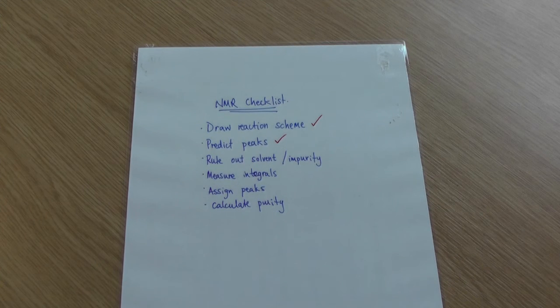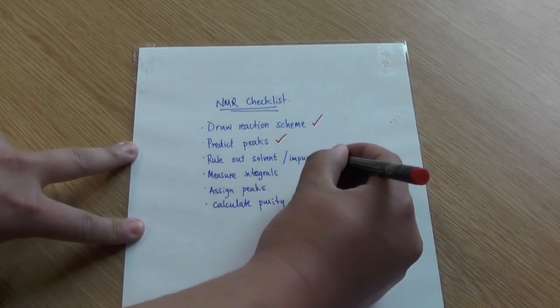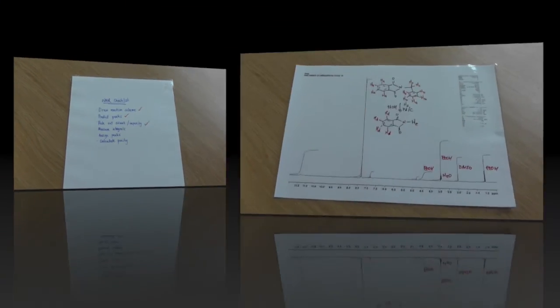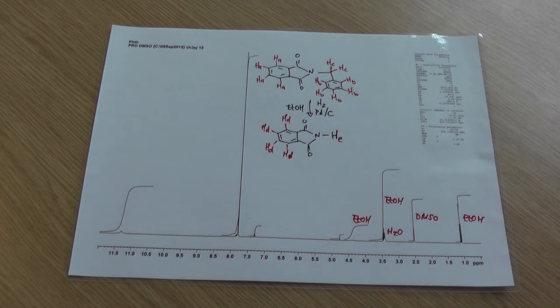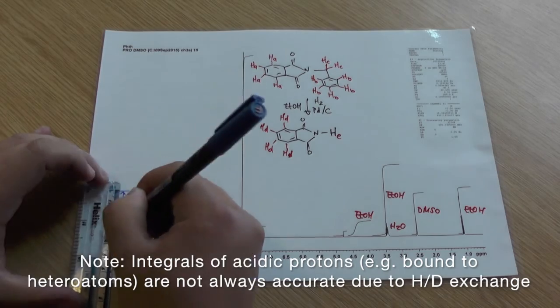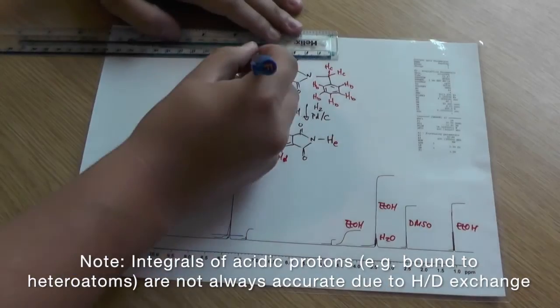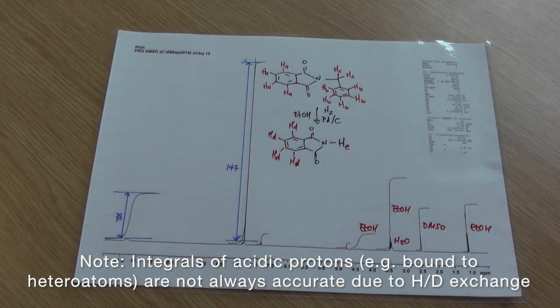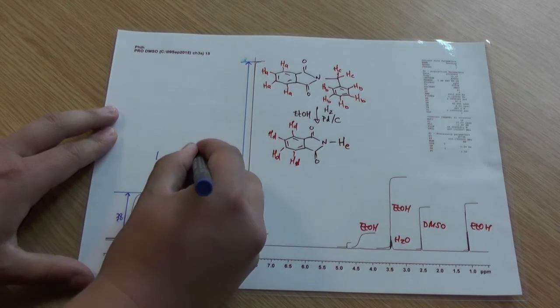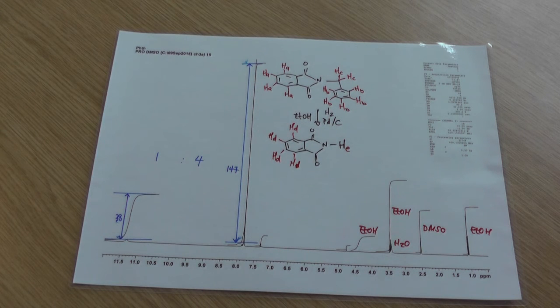Looking back at our checklist, we've ruled out our solvent and impurity peaks. Now it's time to measure our integrals. The easiest way to measure your integrals is to draw a straight line at the top and the bottom of your integrals and then measure the distance between the two in millimeters. Looking at the heights of the two peaks we can see that we've got a 1 to 4 ratio. So now we can assign the peak on the left to the hydrogen attached to the nitrogen of the ring and the large peak on the right corresponding to 4 protons to the aromatic protons of the product.